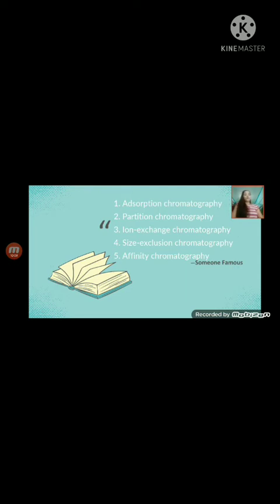Another important thing is that liquid chromatography is a method of physical separation in which the components of liquid mixtures are distributed between two immiscible phases. The example of this is the stationary and mobile phases. The practice of liquid chromatography can be divided into 5 categories.